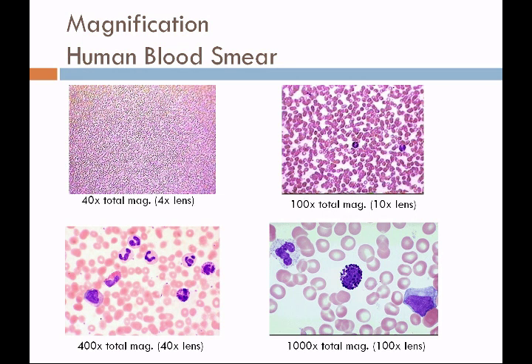This is what you'll see with magnification of the human blood smear. The total magnification when the 4x lens is in place is 40x, because you have 10x magnification from your oculars. At 40x magnification, it's impossible to distinguish the red blood cells from the white blood cells. We call the 4x lens the scanning lens — it's not very important in microbiology because microbes are so small that this magnification doesn't give us much information. At 100x total magnification with the 10x lens, we begin focusing because it gives us some image in the field. It's important when you focus on a cell that you place it smack in the middle of the microscopic field.